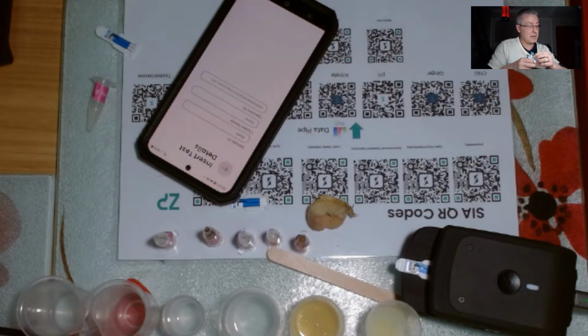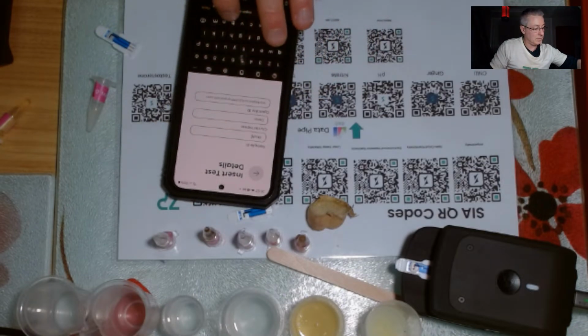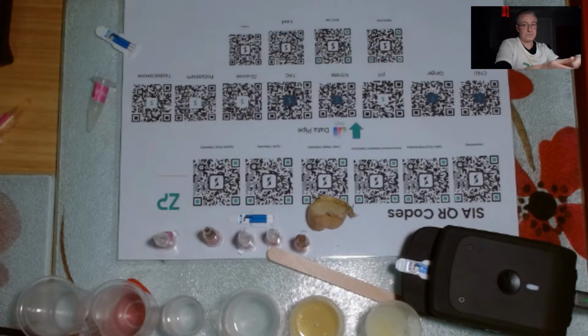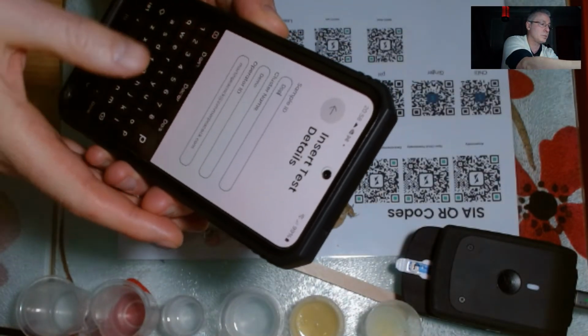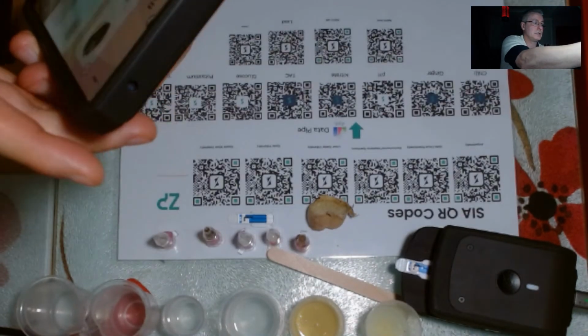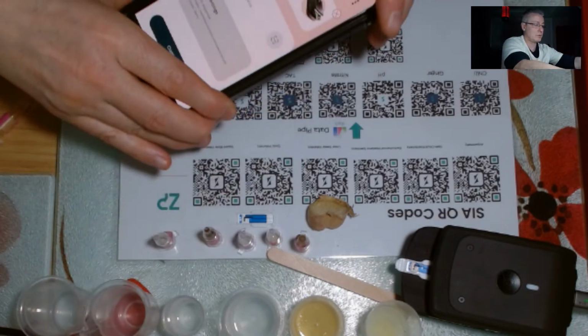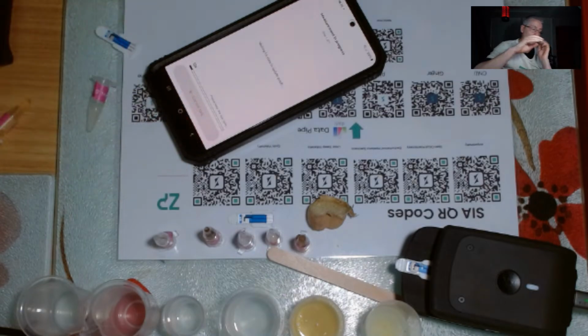I'm just going to give this a name. I'm going to call it dope, if I can remember how to delete that. I'm just going to try and name this now. Yeah, sorry, right. I'm going to call this dopamine. Yep, so I've named that. Done. The sample's on there anyway, so I will just continue, start, and off we go.